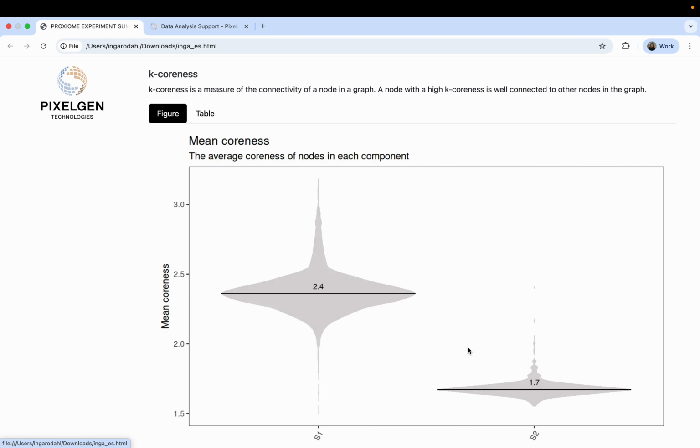First you get an overview of the fraction of the cell types per sample. In this case, we see that in the stimulated sample there is an increase of, for example, CD8 T cells. Then you can also look at the numbers in a different manner, here split by sample, and you also get the actual cell number. You can split between samples, and then you can see how the fraction is changing.